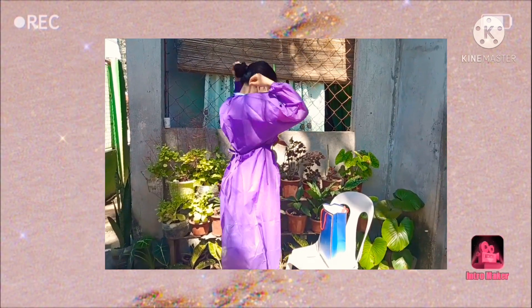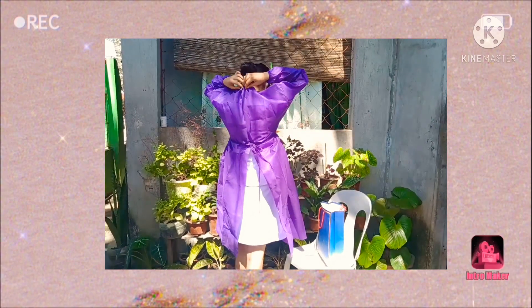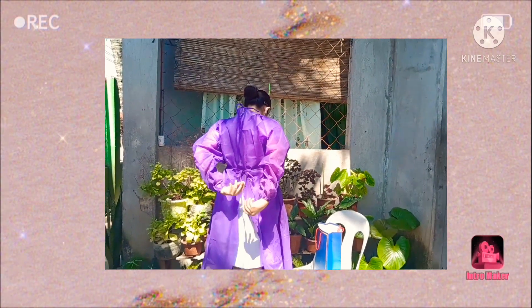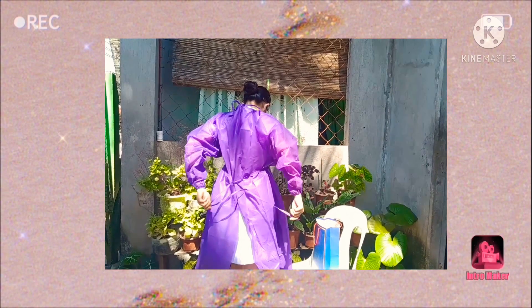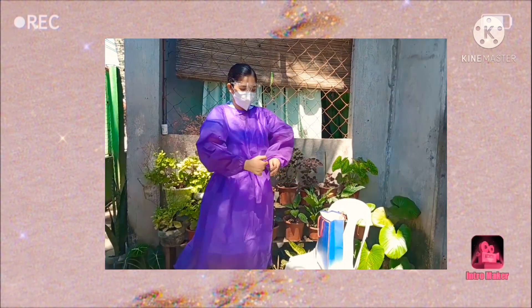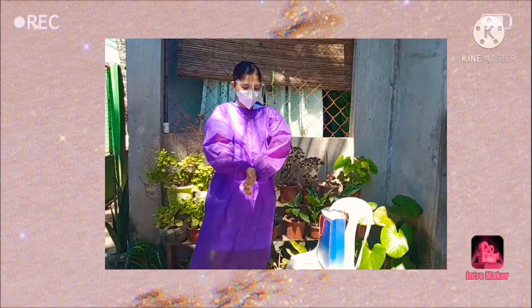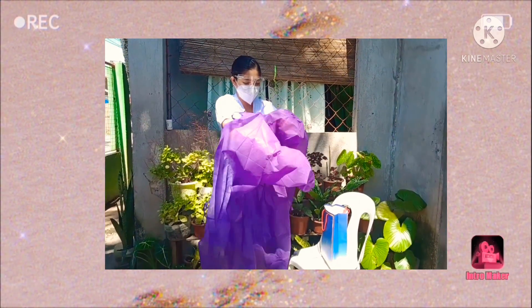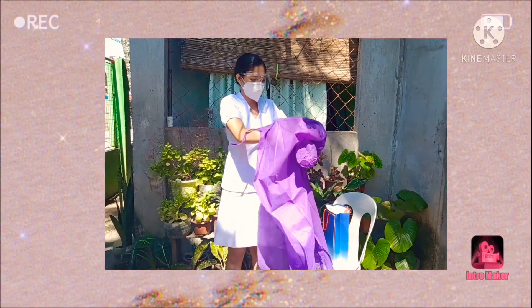Next, remove the gown. Untie all ties or unsnap all buttons. Some gown ties can be broken rather than untied — do so in a gentle manner, avoiding forceful movement. Reach up to the shoulders and carefully pull the gown down and away from the body. Rolling the gown is an acceptable approach. Dispose in a trash receptacle, as this prevents further spread of harmful pathogens.